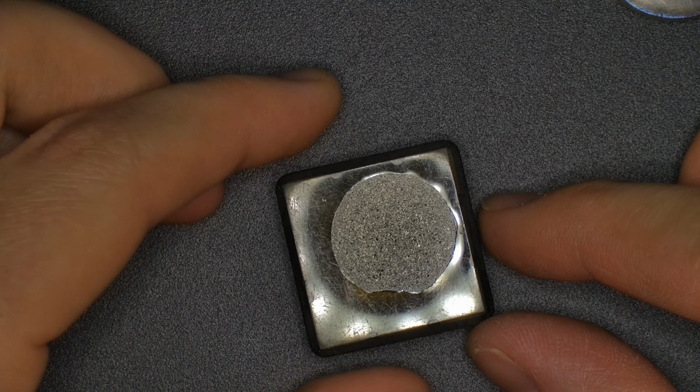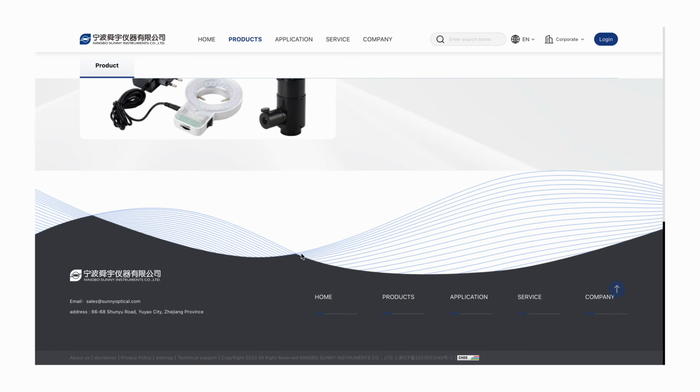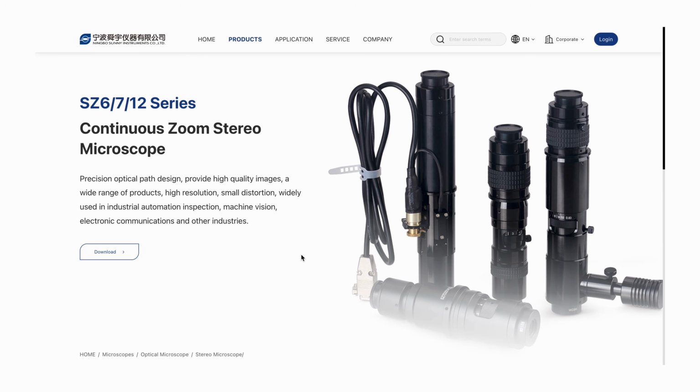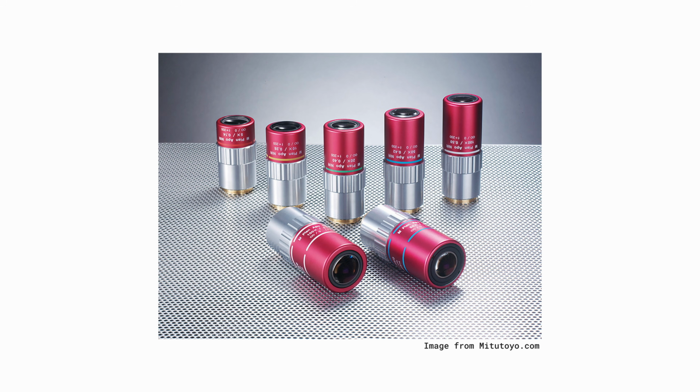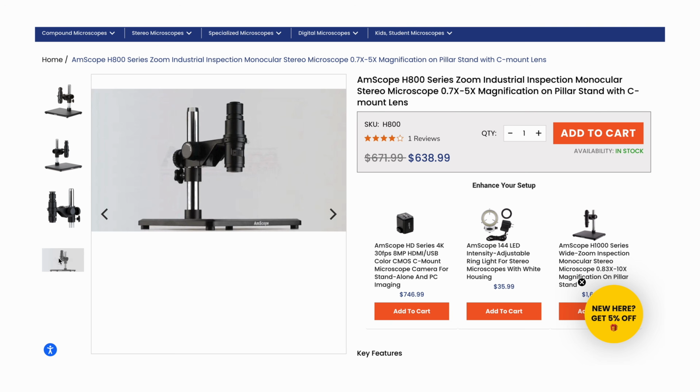Maximum optical magnification is still about 50 times. Blood cells, microorganisms, diatoms, you won't see them. Microstructures of metals or minerals will also be very hard to resolve. I recommend the SZ12 from Sunny Optical simply for its quality and options like metallographic objectives, which significantly increase magnification and resolution. Some devices can also be found on the Microscope page.